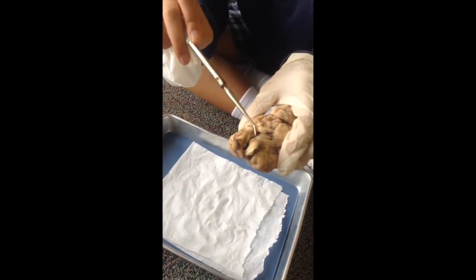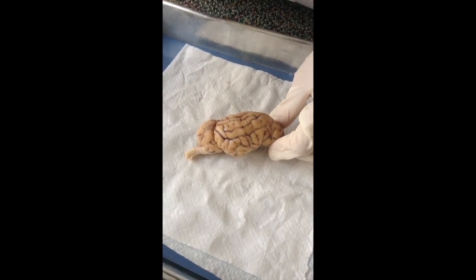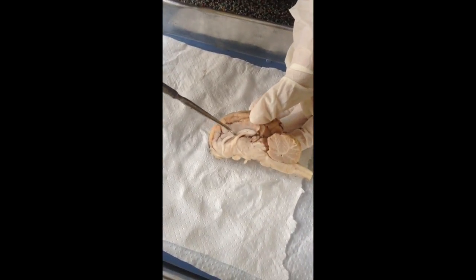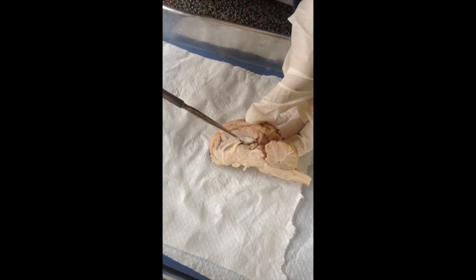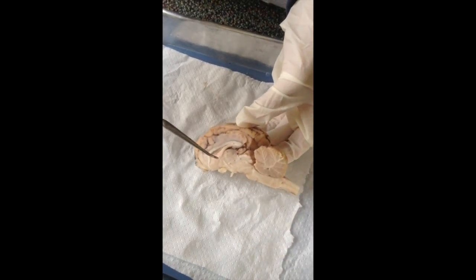There's one right there. We only have one. Okay. Cerebrum. Cerebellum. Corpus callosum. This white thing. Thalamus. The third ventricle. Right here. And the cerebral aqueduct.